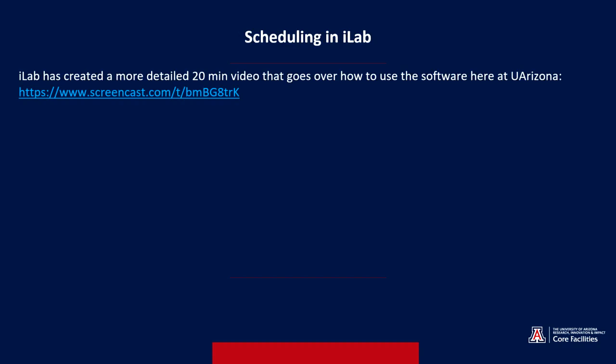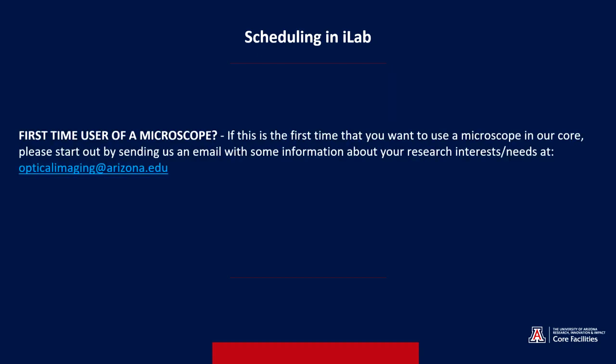iLab, or Agilent, has created a more detailed video that goes over a wide range of the ways you can use the software at the University of Arizona. I won't go into detail on anything other than how we use it for scheduling.